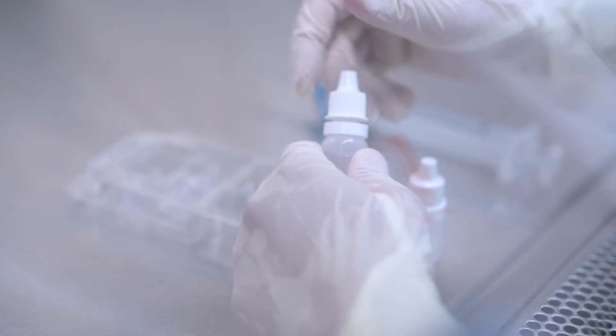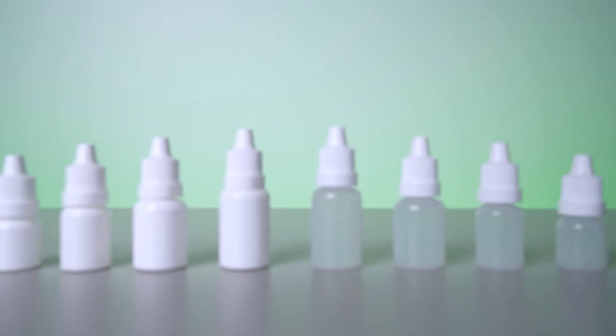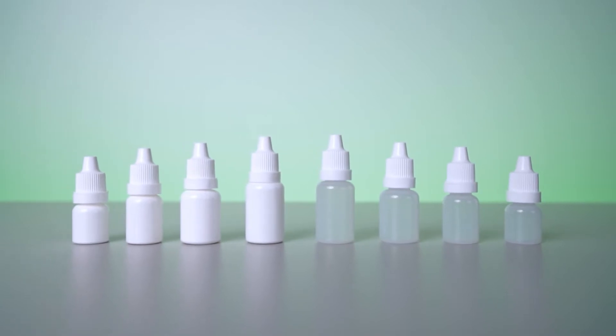The MD dropper bottle is temper evident and suitable for various formulations and viscosities. Bottles are available in white and clear and various format sizes including 5 milliliters, 8 milliliters, 10 milliliters and 15 milliliters.